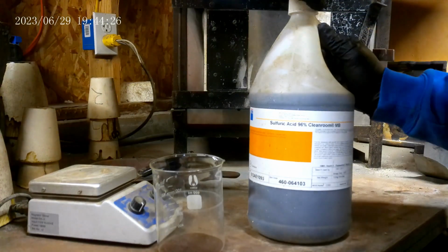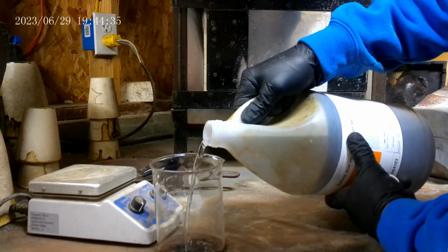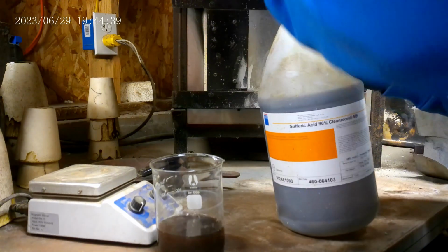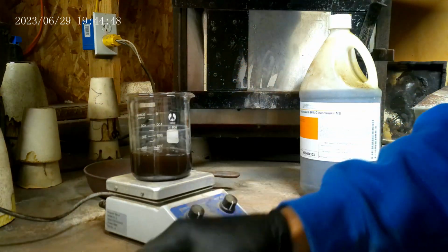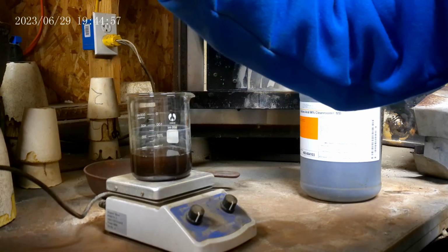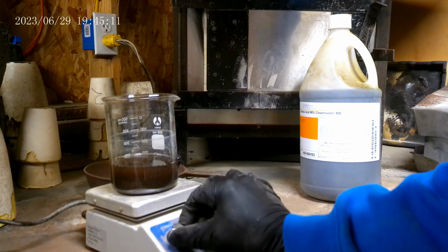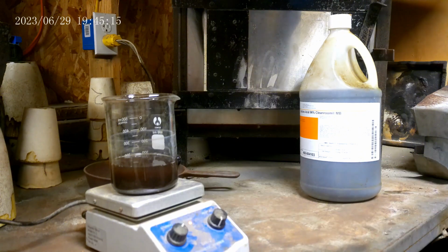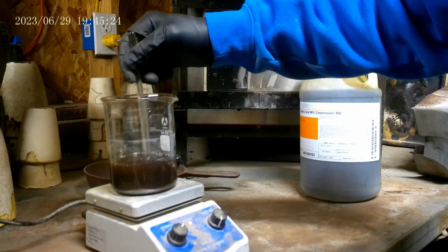Okay, I don't have my hood on yet because it's loud, so I'm wearing my full face mask. Add carefully concentrated sulfuric acid. We'll put it on there, drop our stir in there, get this plugged in. Okay, let's turn the stir on. So now it needs a little help to get going. A glass stir rod here. A little gummed up in there.